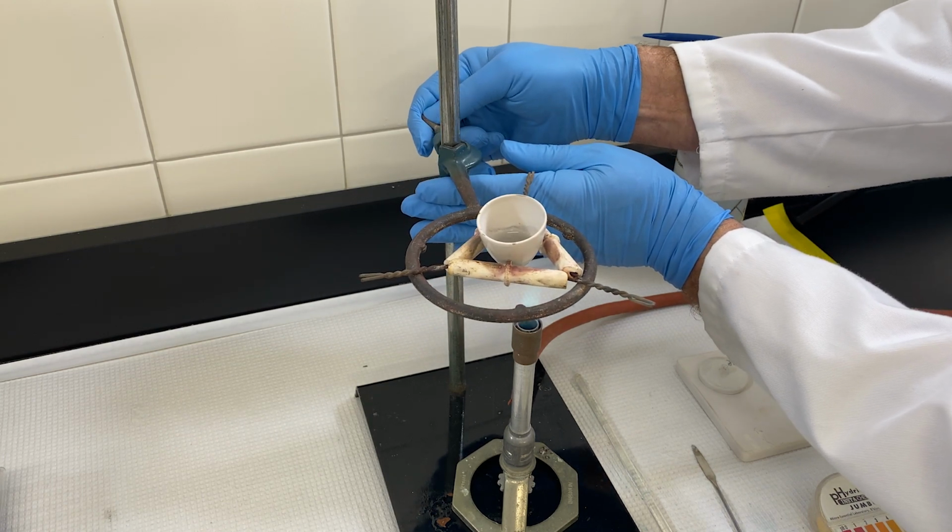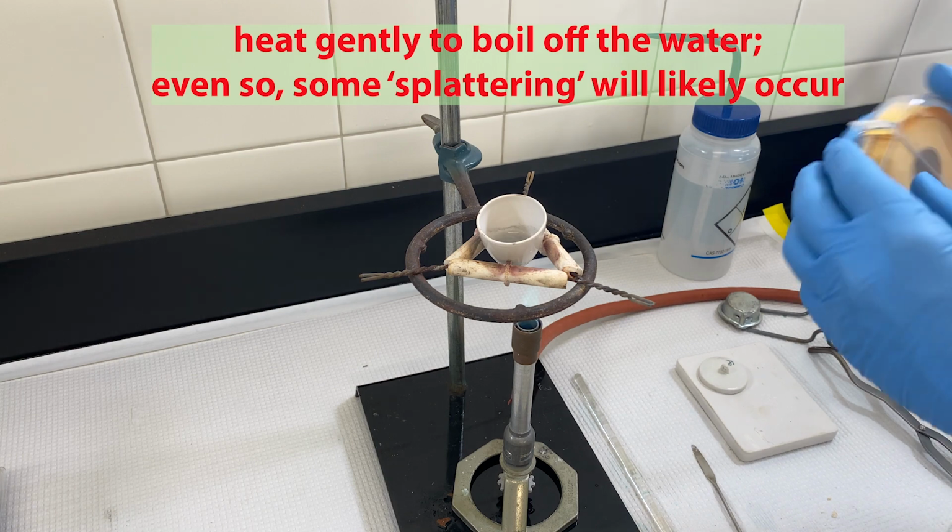With it well mixed, let's begin the second reaction.